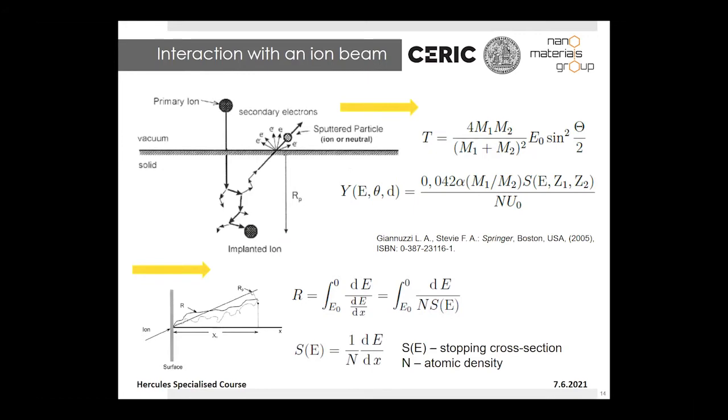As you heard about it already, I will not go further. If you have any question, do not hesitate to interrupt me in the middle, to make it as interactive as possible. So now I will move to interaction with an ion beam, because it's what we haven't heard yet.